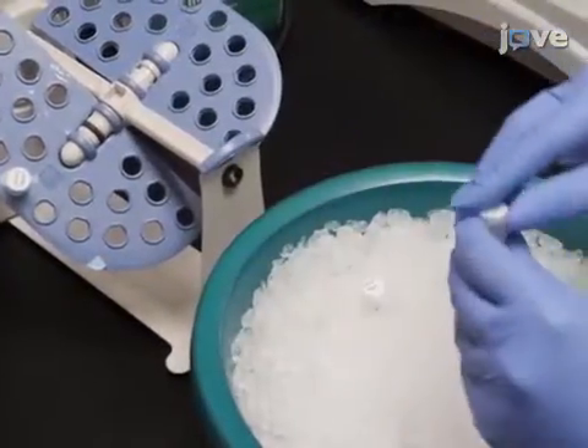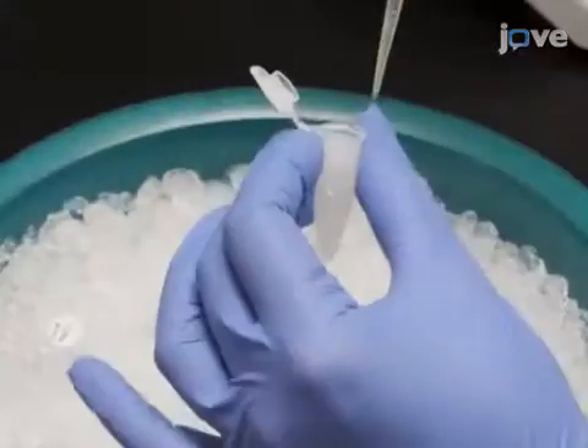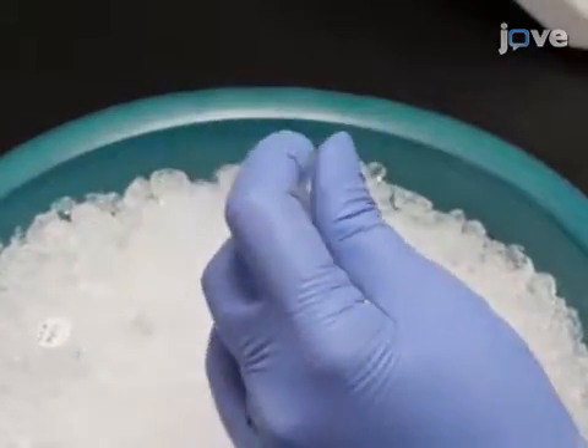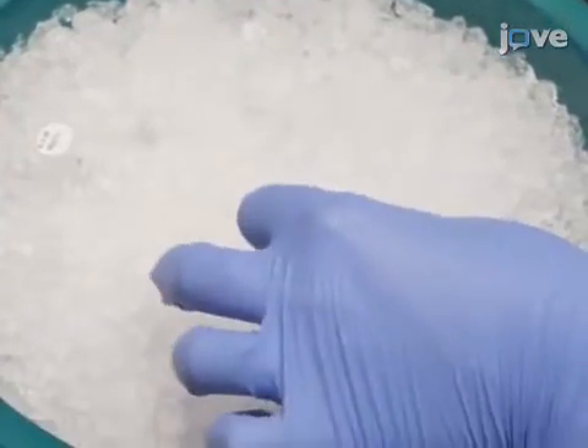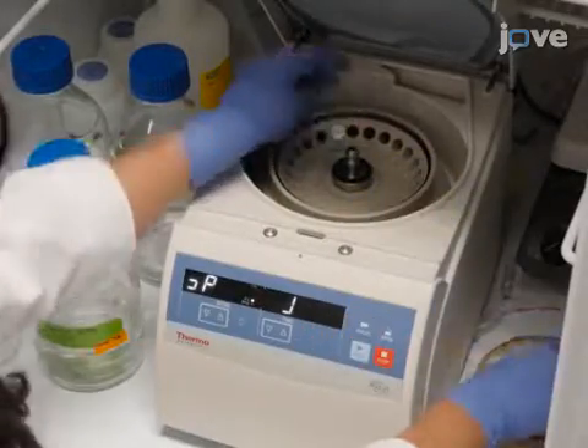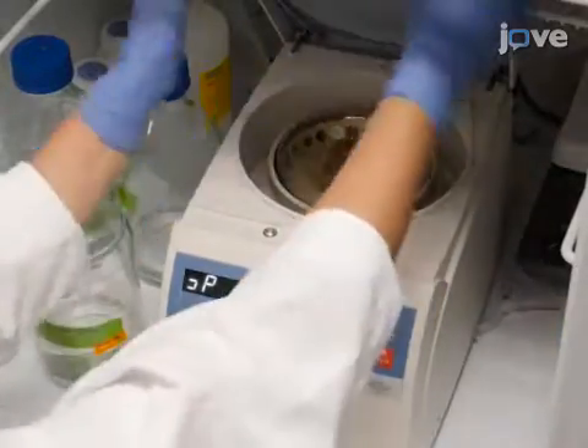Remove the tubes from the rotator, add 50 microliters of ice-cold 0.5 molar MgCl2 to each tube, and incubate them on ice for 10 minutes. Then centrifuge the samples at 11,000 times G and 4 degrees Celsius for 10 minutes.